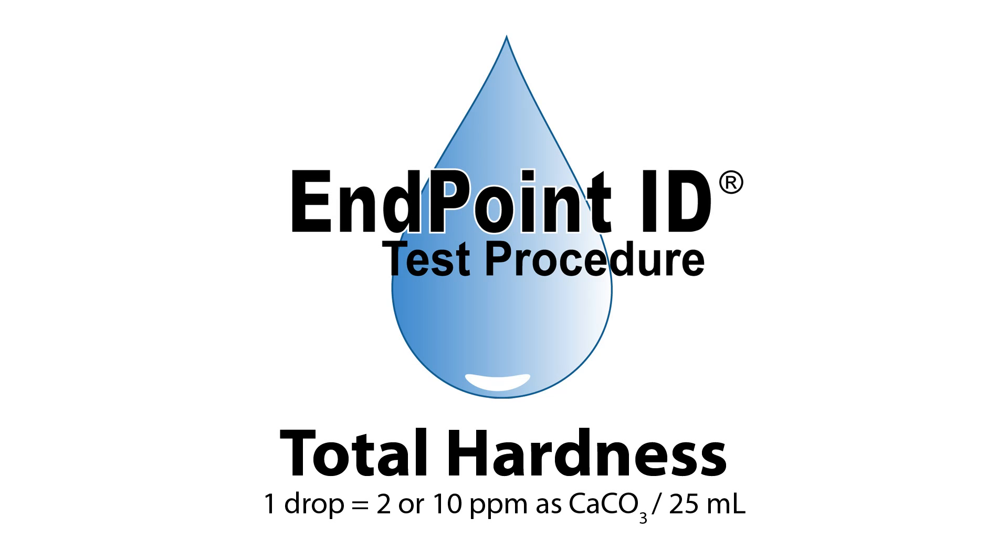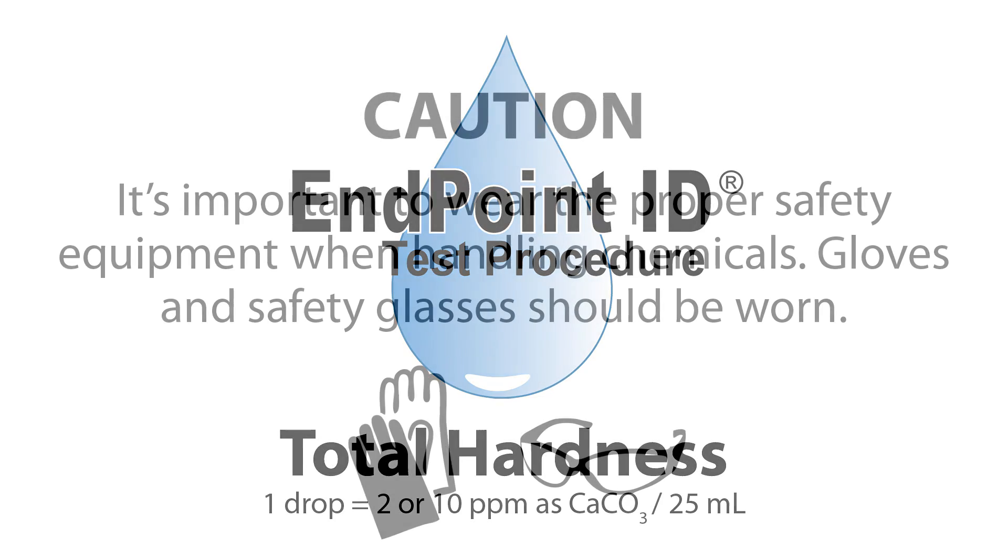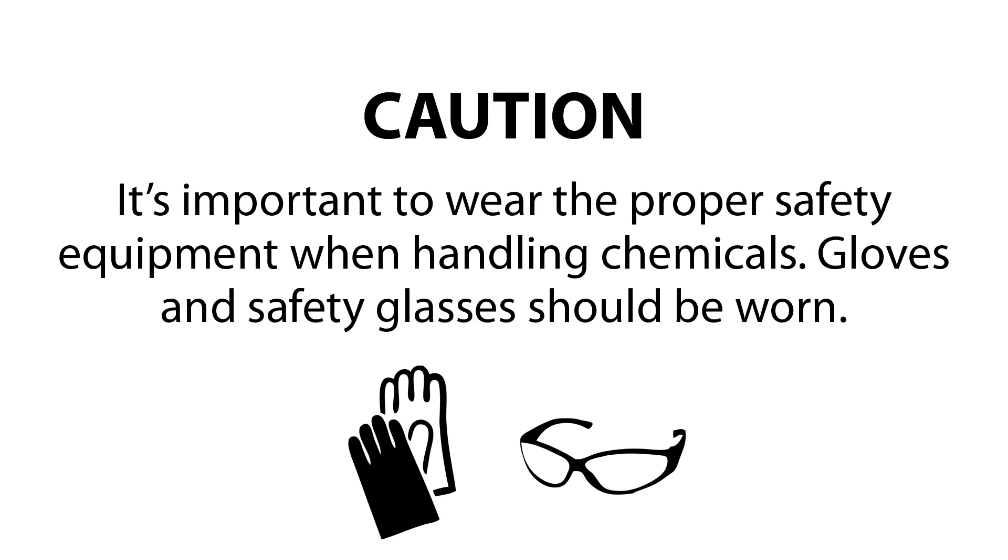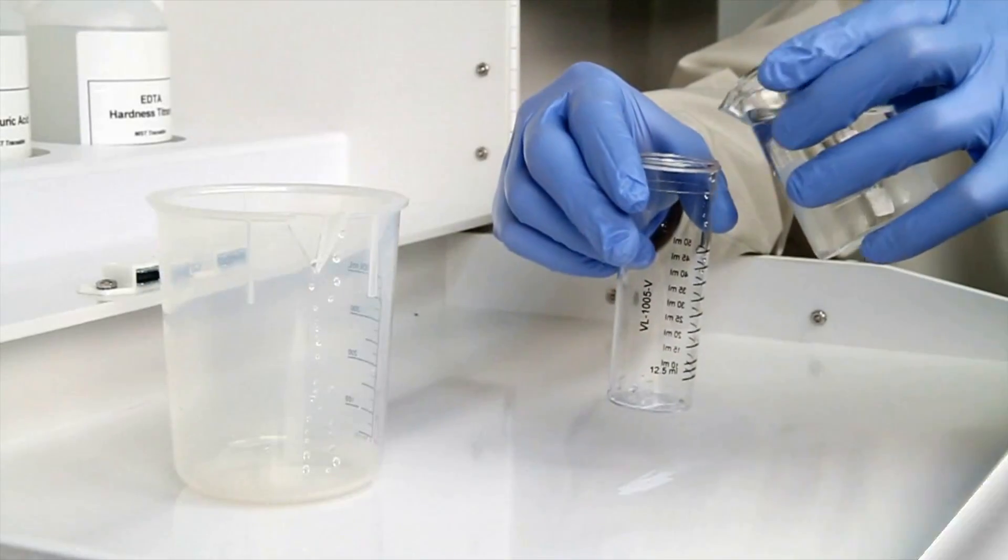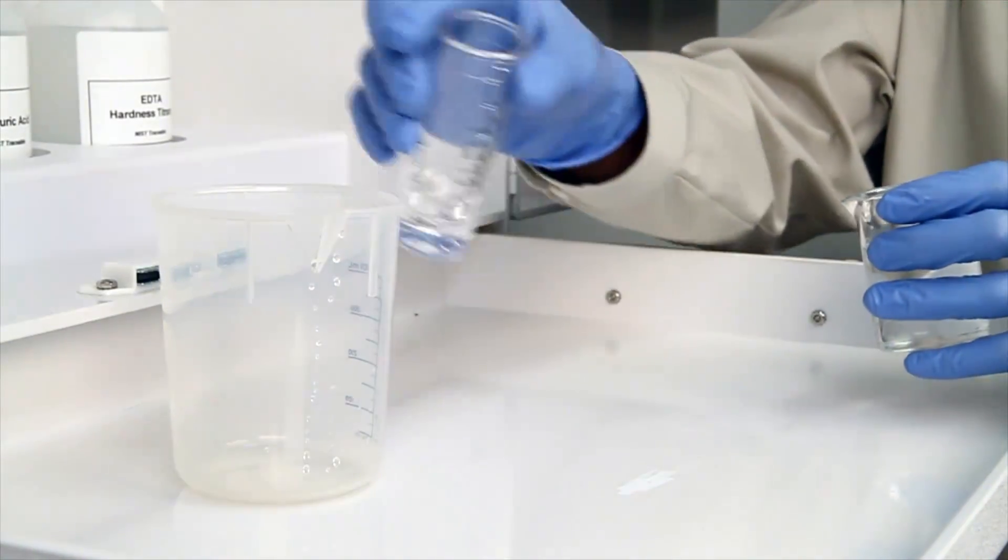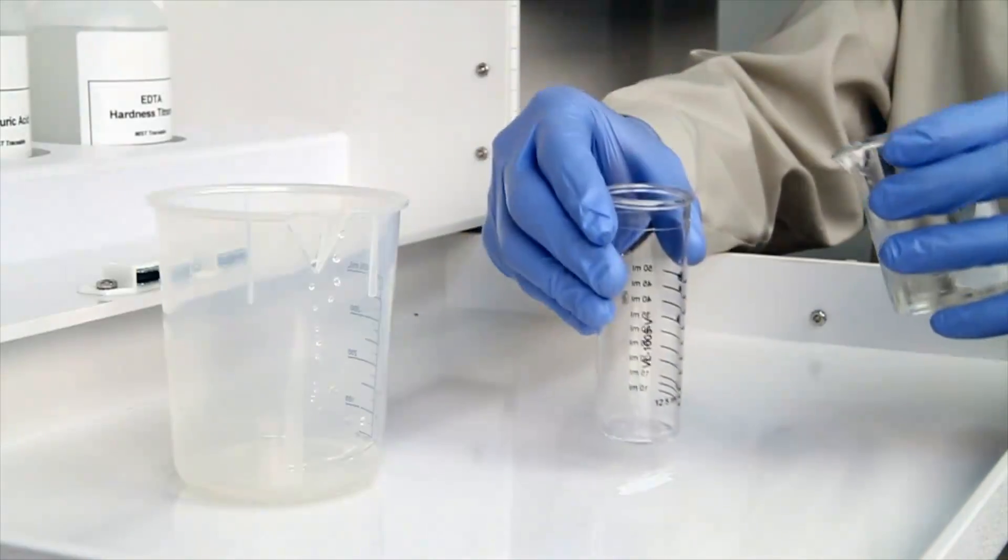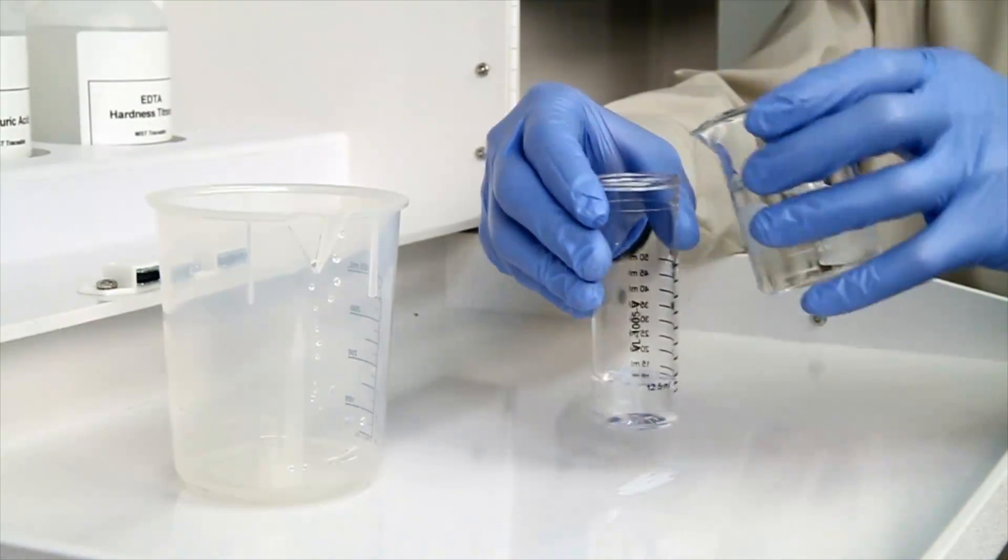This is a demonstration of a total hardness drop count test kit using Endpoint ID procedures. The first step according to the Endpoint ID procedure is to gather an accurate sample. The smallest change in sample size will lead to inaccurate results.